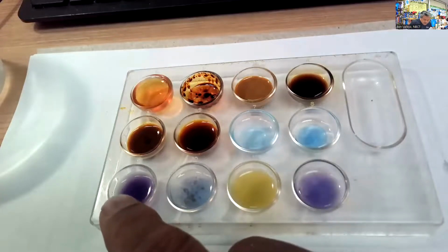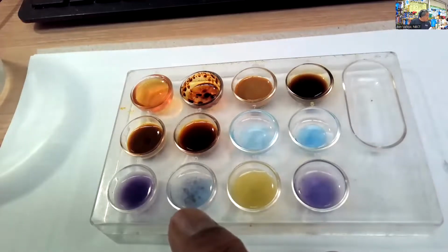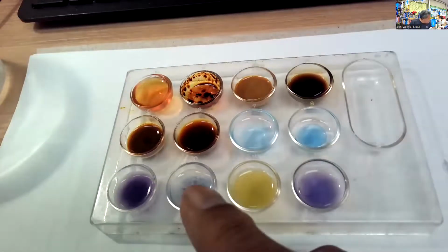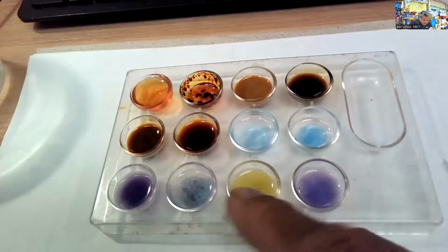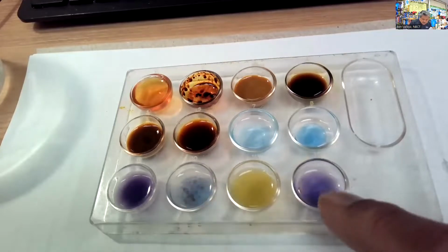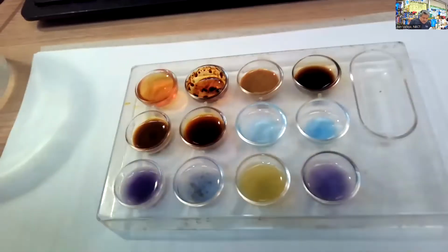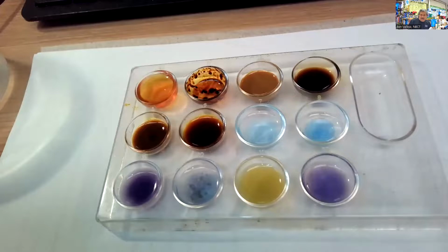But over here you have milk. Milk has protein in it. You have juice and, no, this is oatmeal and juice. Neither of these tested positive for proteins, but the unknown did. As you can see, it's a nice purple color right there.